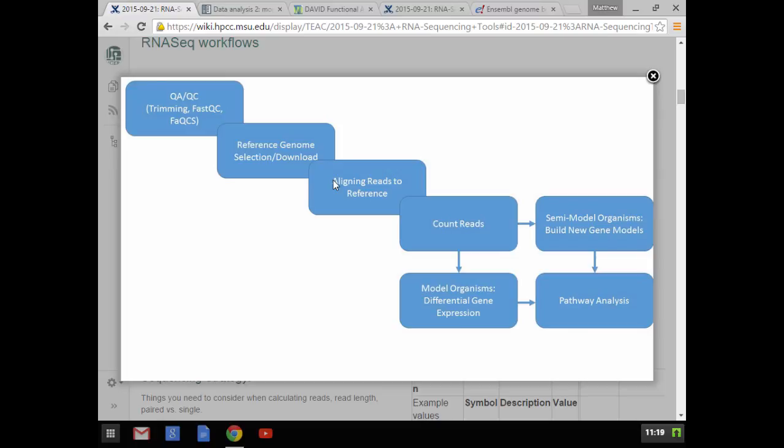There are a lot of papers that you can go and find and a lot of arguments that you can go and read of why that is a better or not better way than using a method like the cufflinks, cuffdiff, cummeRbund mechanism, which uses RPKM values instead of absolute read counts. To take a minute to describe that, the difference is absolute read counts here is just counting how many reads aligned to any given gene.